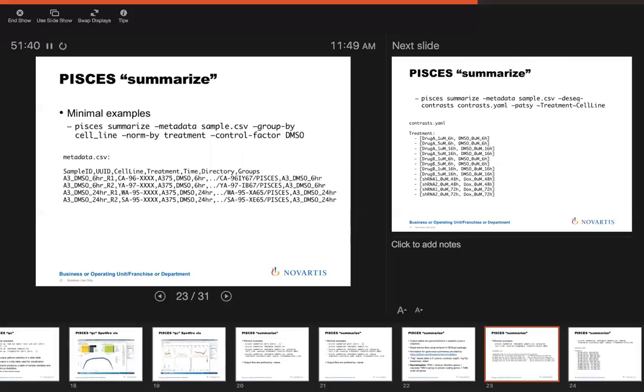We have a mixed number of samples with different library preps. And so it's very easy just to look only at the poly A subset of the genome, and then say, okay, that's what we care about. Let's get it right, and let's figure out the rest of it later. And I'm perfectly fine with that. It's just the idea of going back to non-coding that wasn't part of the normalization. Right. And as long as we start with coding, I'm perfectly fine with it. It's actually very close to what I'm doing. Okay, that's good to hear. So just in the few remaining slides, I wanted to describe, I think the implementation is sometimes important.